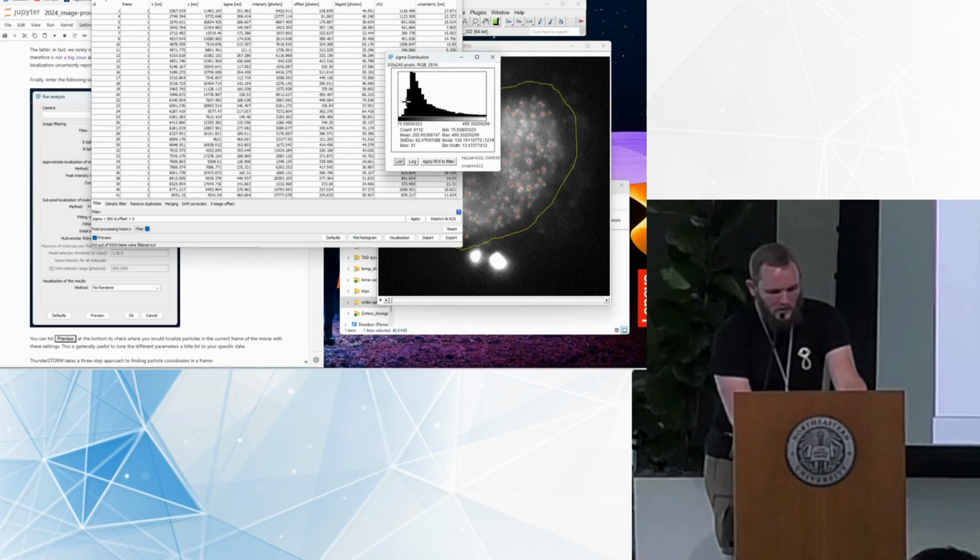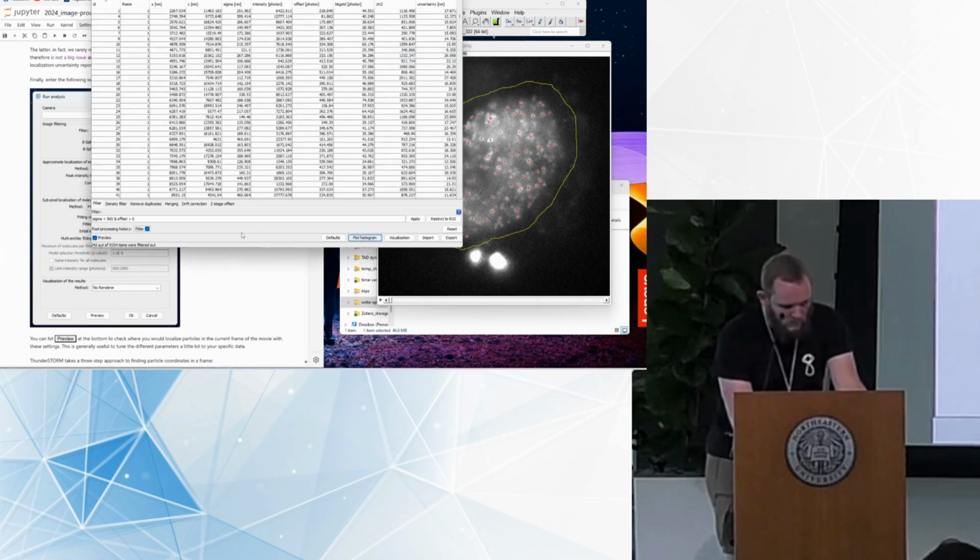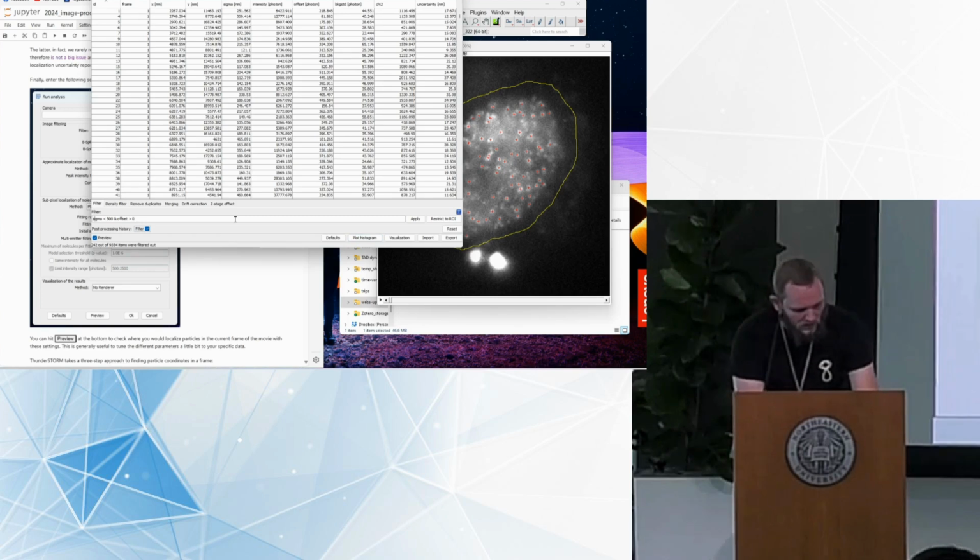So here we have a nice peak with most of the localizations being somewhere between 100 and 200, and a relatively fat tail with localizations beyond that. So what I like to do is be relatively restrictive in where I cut this. In this case, let's cut at like 200 nanometers, for example, which means down in this line here, I say sigma smaller 200.